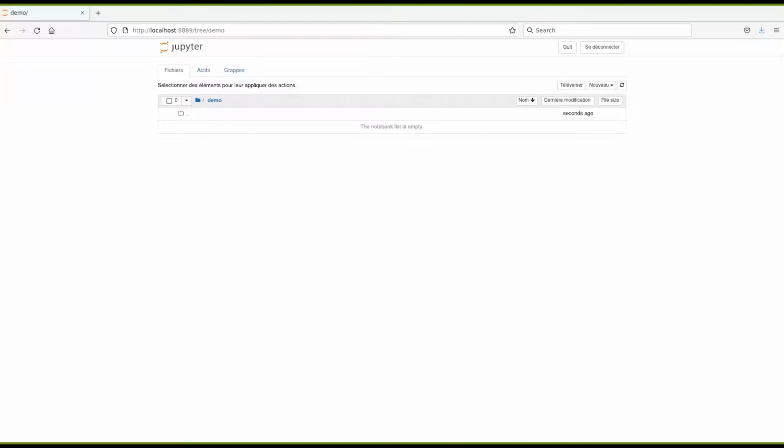Good morning. I'm Jérôme Kiefer and I will present a short tutorial on how to perform the calibration of a diffraction image using the Jupyter notebook. I'll show you my screen. The Jupyter notebook looks like this. Usually you access it via a web browser.